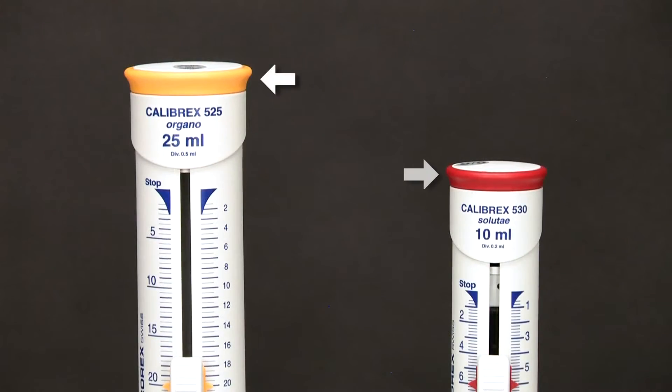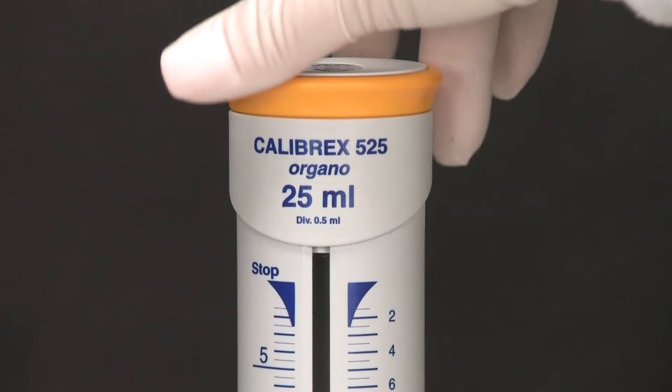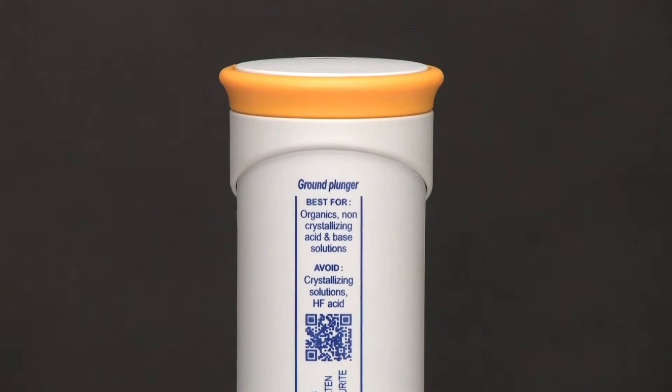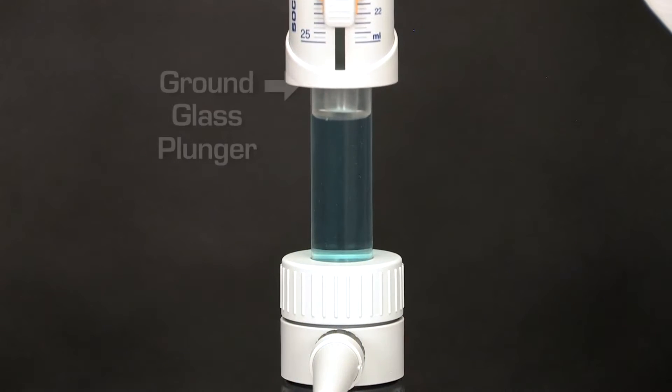Each of the two models is identified with a color code. The Organo model is best suited for organics, non-crystallizing acid, and base solutions because of its ground glass plunger.